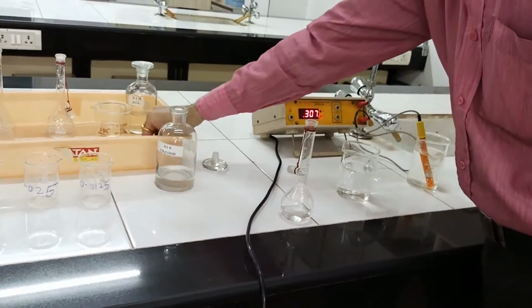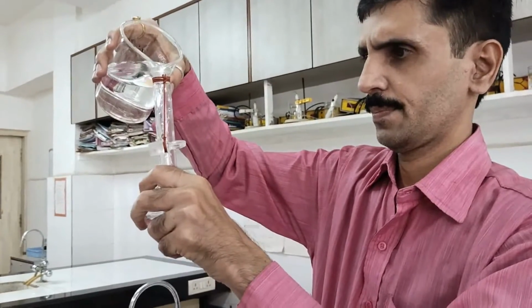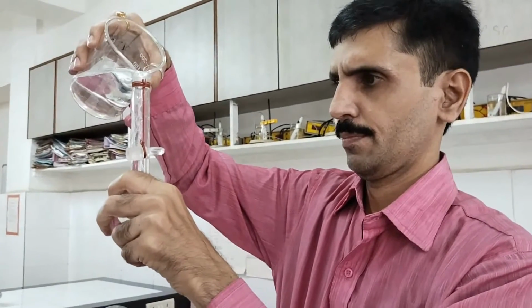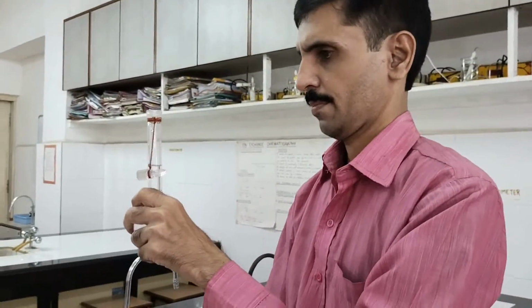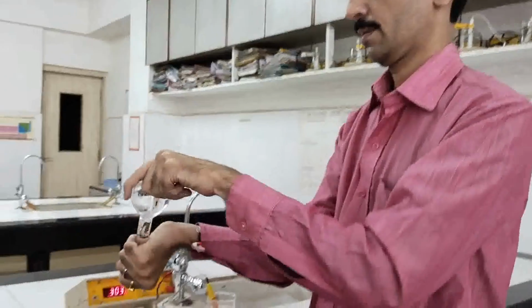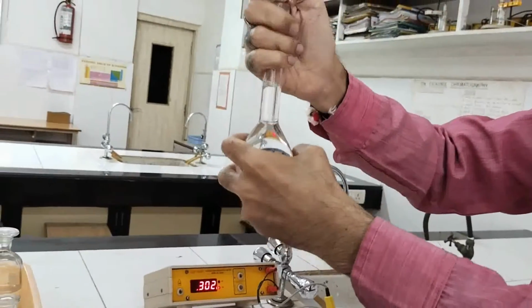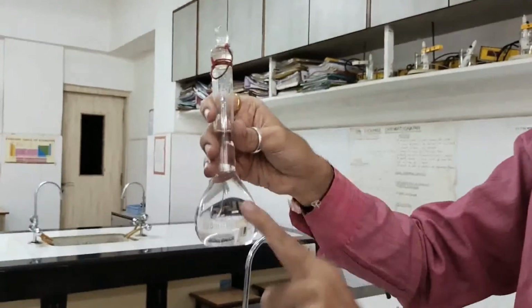Same procedure again. Now we are going to dilute it with conductivity water, holding this to our eye level. Yes. So you can see it is up to the mark. Close it. Make the solution homogeneous. Now this is 25 diluted to 100. 4 times dilution, so concentration becomes 1/4. And this concentration now of acetic acid will be 0.025. So I will transfer into that respective beaker.